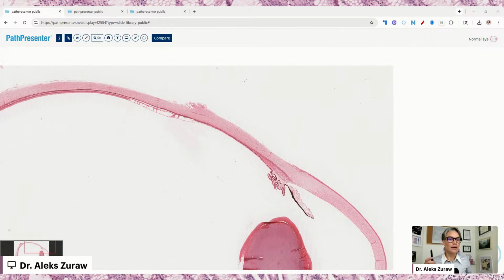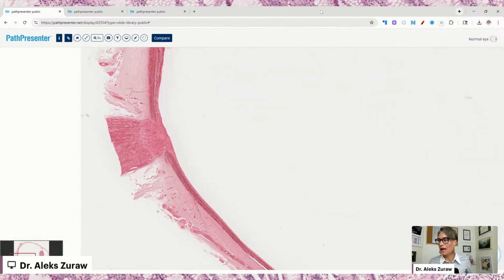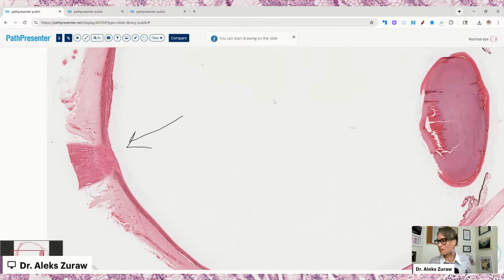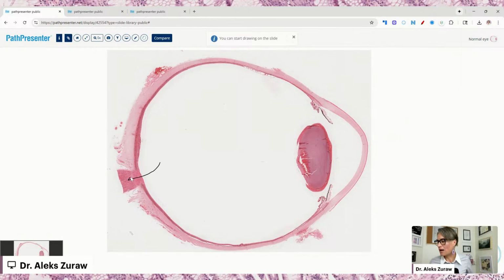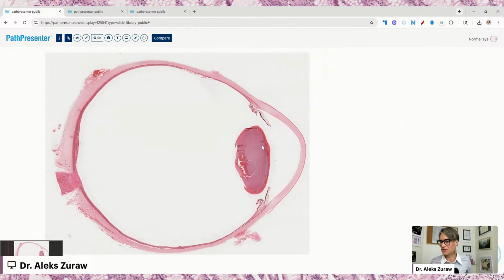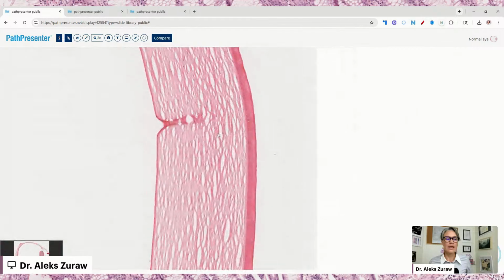And then the main goal of the eye is to see, right? So we have to have the neural connection to the brain, and this is what we have right here on the back of the eye. It goes out to the brain because this is our optic nerve. Starting with the fibrous tissue, from the very front, we have the cornea.